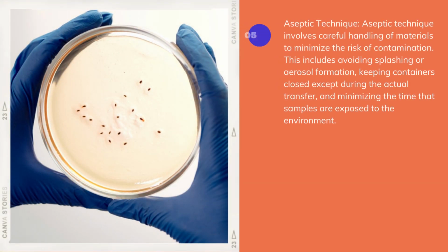Fifth, aseptic technique. Aseptic technique involves careful handling of material to minimize the risk of contamination. This includes avoiding splashing or aerosol formation, keeping container closed except during the actual transfer, minimizing the time that samples are exposed to the environment.